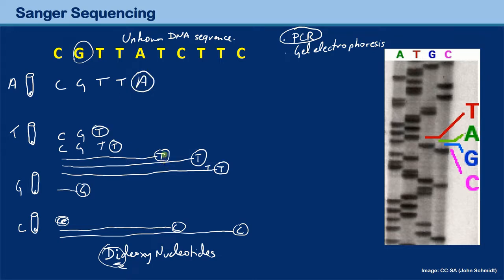And so what we're doing right now is the following. That was step one, the PCR, so we finished that. And now we're going to go into gel electrophoresis. You have to understand that in gel electrophoresis, the long DNA fragments will not move as far as the short ones. So the short ones move very far in the gel.